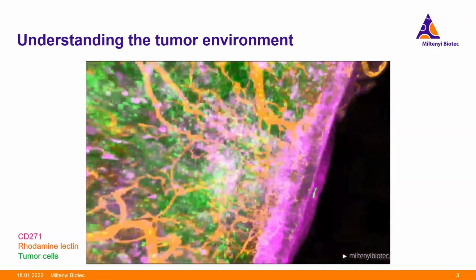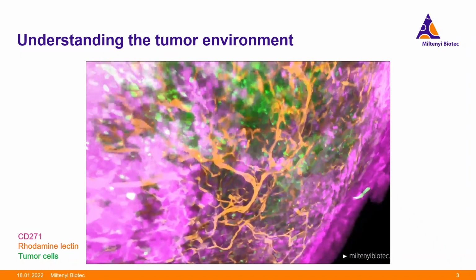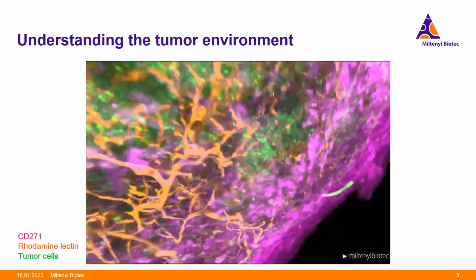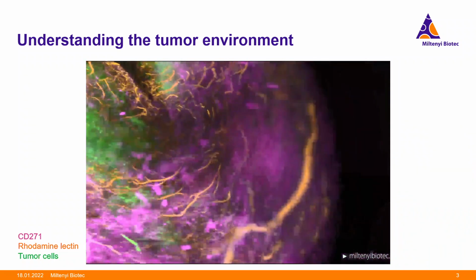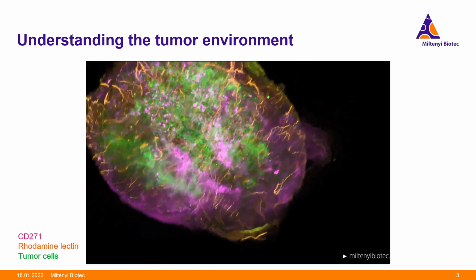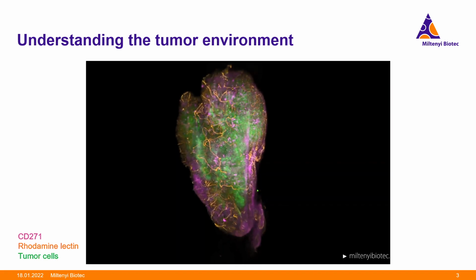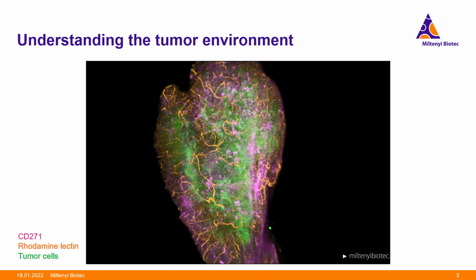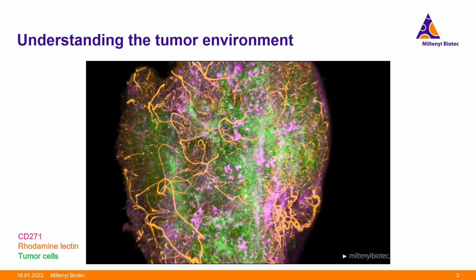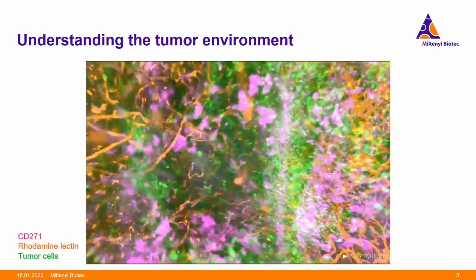In this video, we explore xenograft of a human pancreatic carcinoma cell line, shown here in green, in addition with the infiltrating CAR T cells represented in magenta. The volume rendering allows for the investigation of the interaction of the CAR T therapy with the cancer cells in its native environment. The 3D spatial interactions of the cells within the tumor has become crucial to understanding many aspects of tumor biology, including that of tumor growth, progression, prognosis, and treatment avenues.